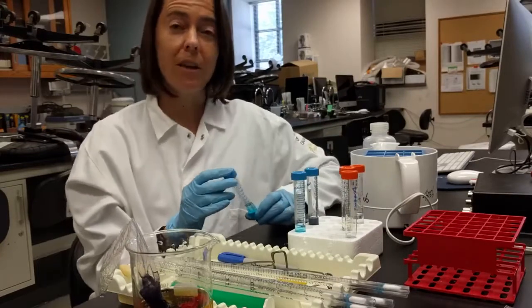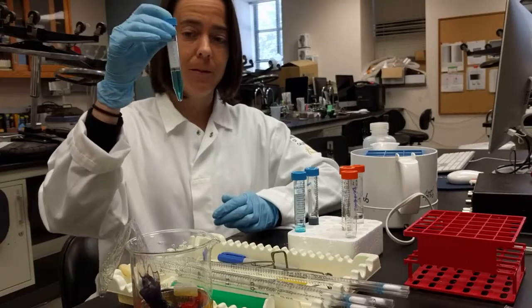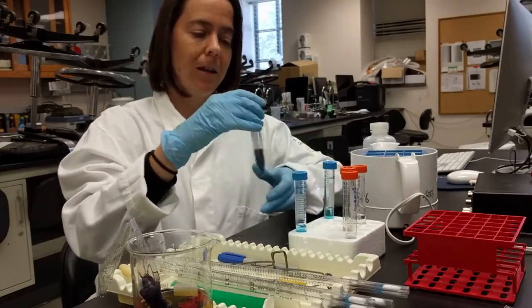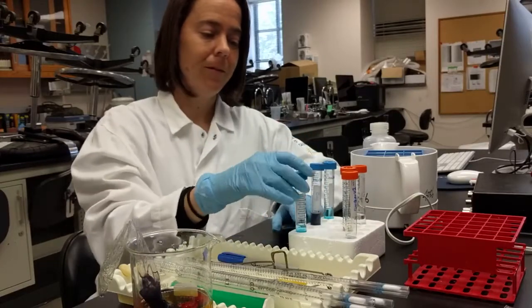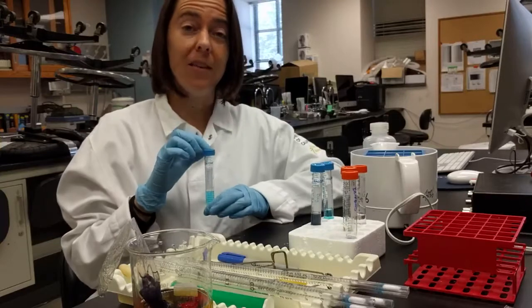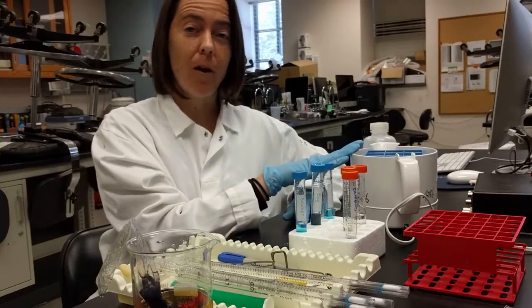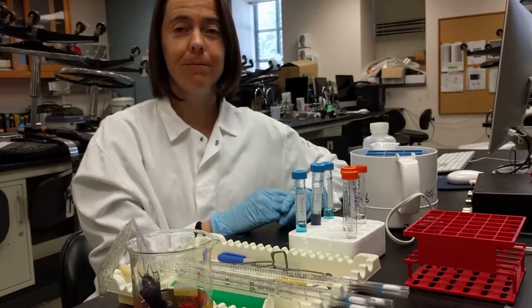Okay, so let's look at the color before we heat these up. Okay, so this is the control, so make note of that color. This is the bag. And this is the beaker. Okay? All right, so I'm gonna add them to this water bath and heat them up for about 5 minutes, and then we'll take a look at the color.